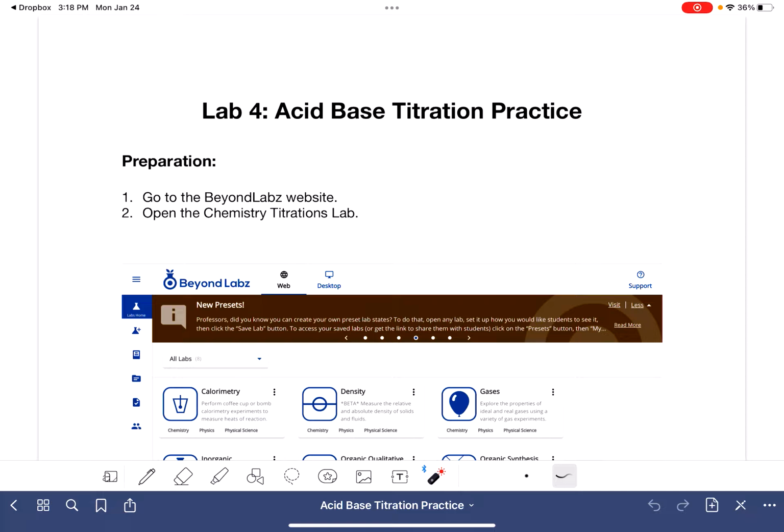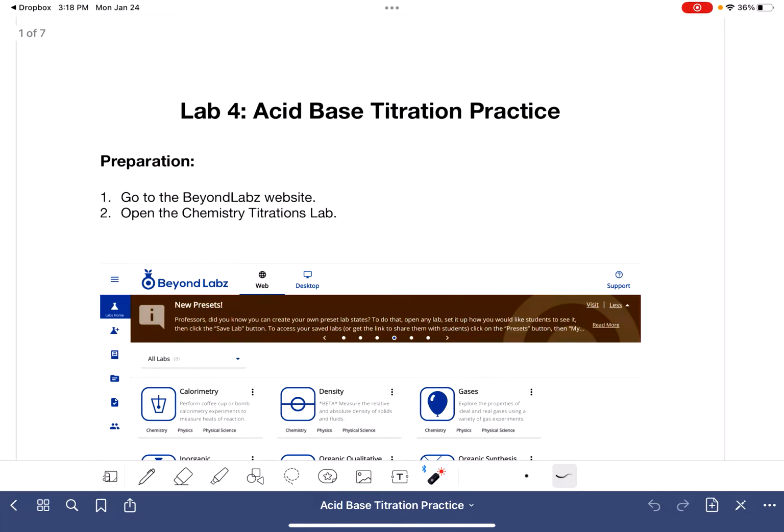In this video, I'll give you some tips for post-lab for acid-base titration practice. Most of the questions on this post-lab are just in the form of data tables. You'll be doing quite a bit of calculations.